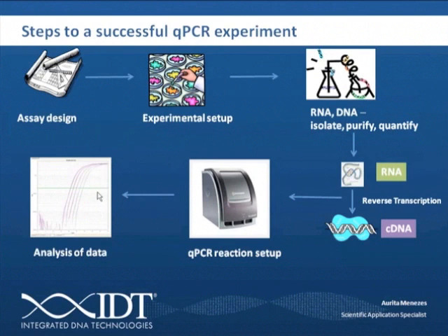Due to time constraints for this talk, I'm only going to be able to focus on assay design, experimental setup, and the factors that affect RNA isolation and reverse transcription. We'd have to save analysis of data for a completely separate webinar.